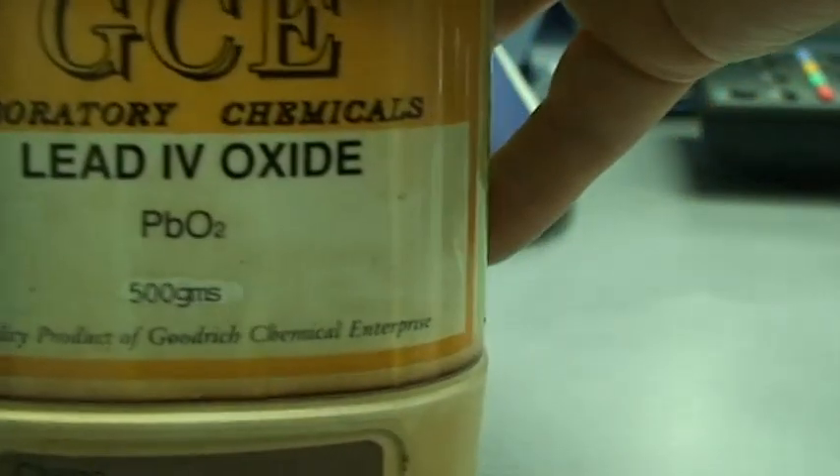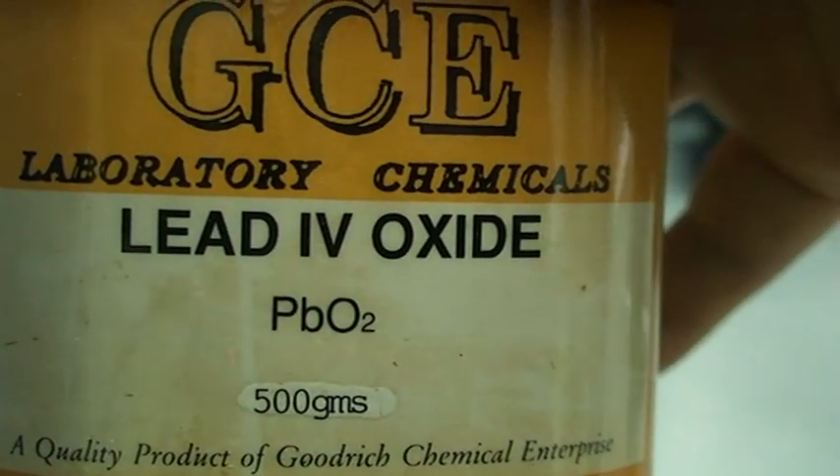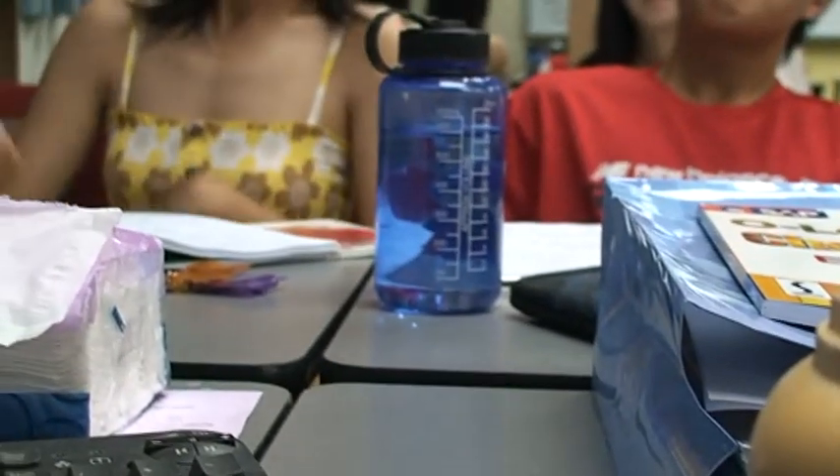This is lead(IV) oxide. It is called lead 4 because its formula is PbO₂. So we have lead(IV) oxide here.